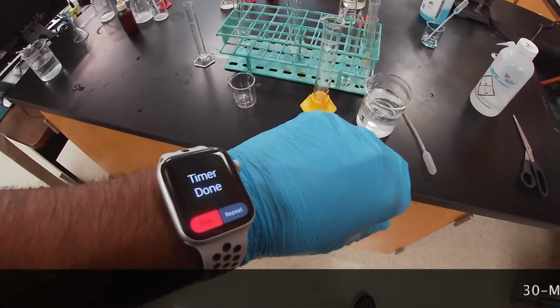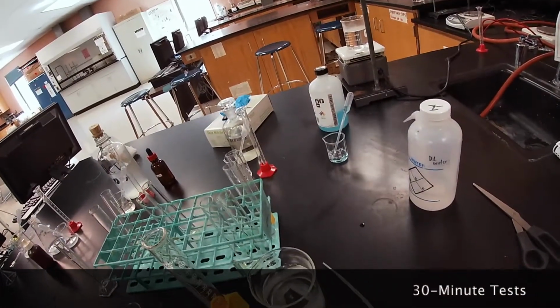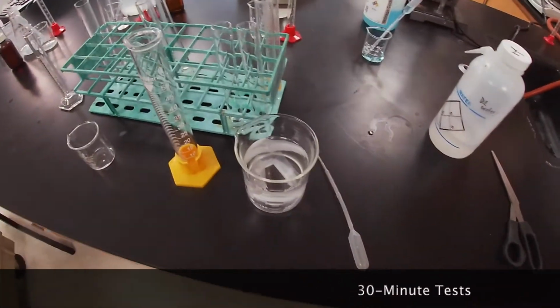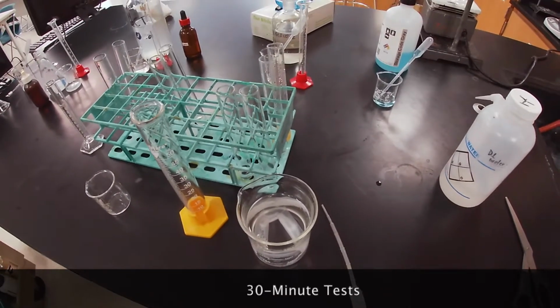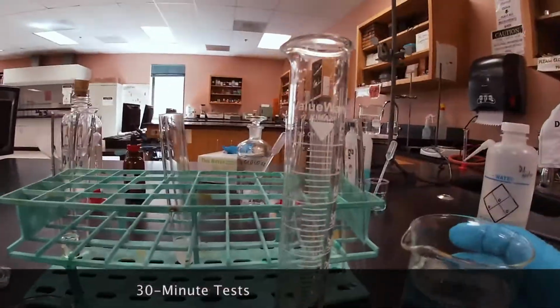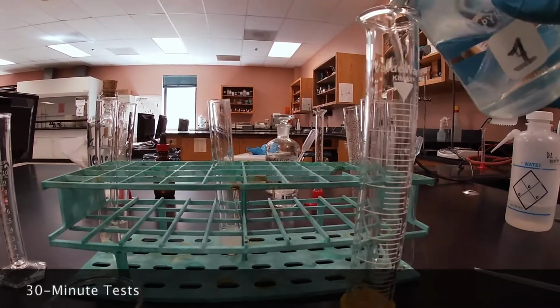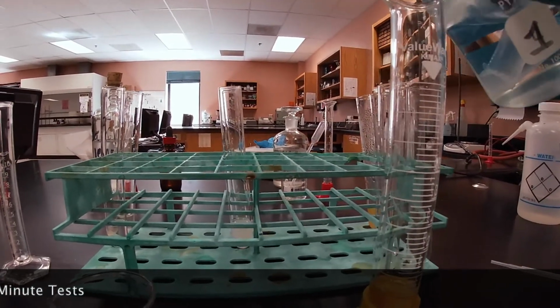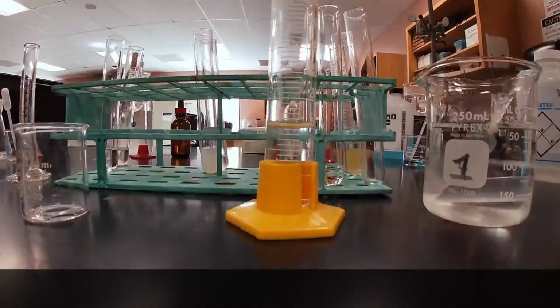After the 30 minutes are done, now what we're gonna do is measure out the outside. Again, we're gonna pour out 15 milliliters of the solution outside of the dialysis bag into a small beaker. So again, we're gonna measure out 15 milliliters of this stuff. Okay, came really close.